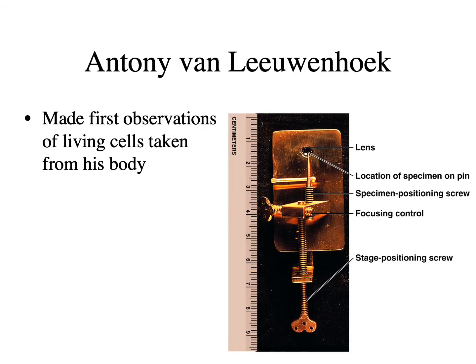The first microscope was made by a Dutch eyeglass maker called Leeuwenhoek. And the principle of his microscope is really pretty much the same as a modern microscope. It's just a curved piece of clear glass that's like a magnifying lens. And then he had a screw that was adjustable so he could basically control the focus.